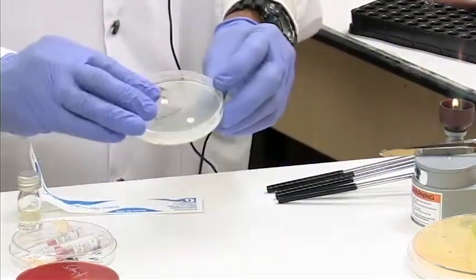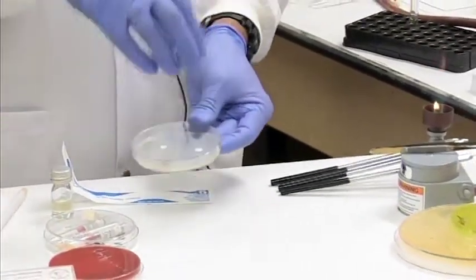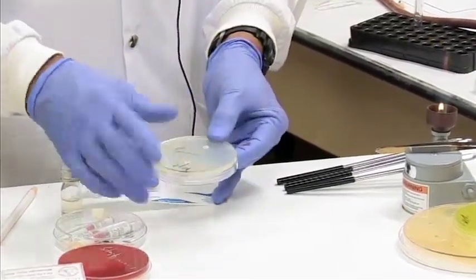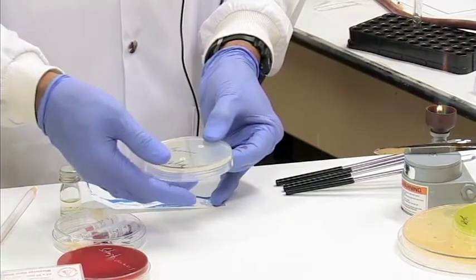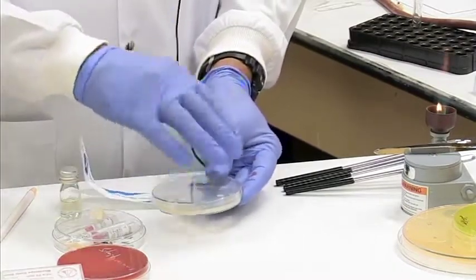you're going to take your plate now and incubate it, take it to the incubator. Now, notice I added the antibiotic in this direction. When you're incubating your plate, you have to invert the plate back this way with the agar on top. The reason is that overnight during incubation, sometimes moisture will form on the cover, and if you invert it the wrong way, moisture or water droplets will fall onto your plate and mess up your reaction.